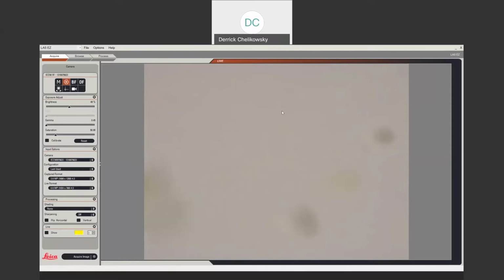This happens with some of these organisms. Now, the pyrenoid, if you look at your, here we go. Here's some slow guys. Here's a nice Chlamydomonas. Nice little circle. Here's another one right up there.